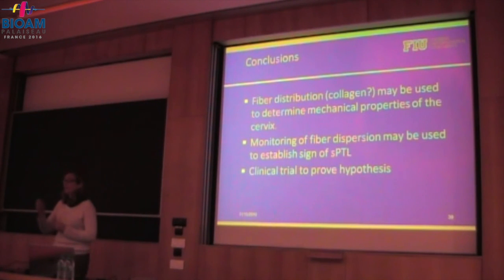There are levels of roughness, I think, where polarization in certain conditions can be used more effectively. But I'm not claiming to be a speckle expert, but we looked at it, and for this study, since we wanted to do other things aside from roughness, we did it with polarimetry.